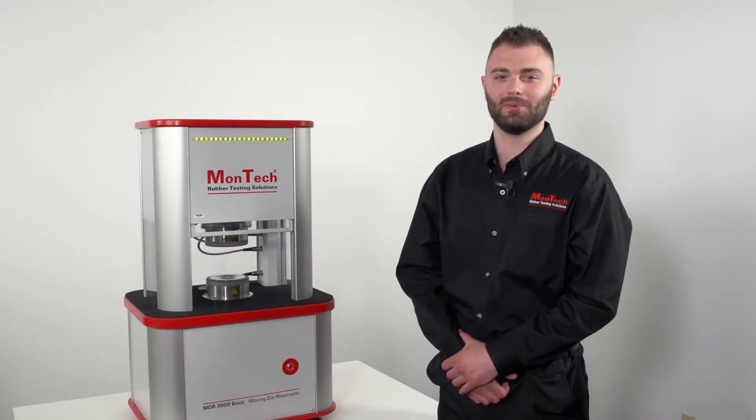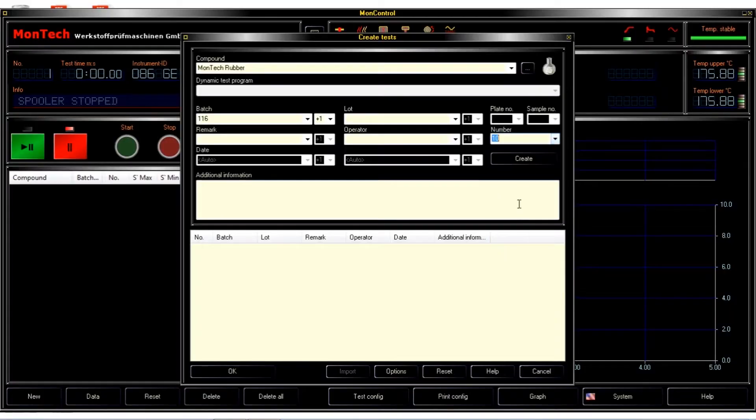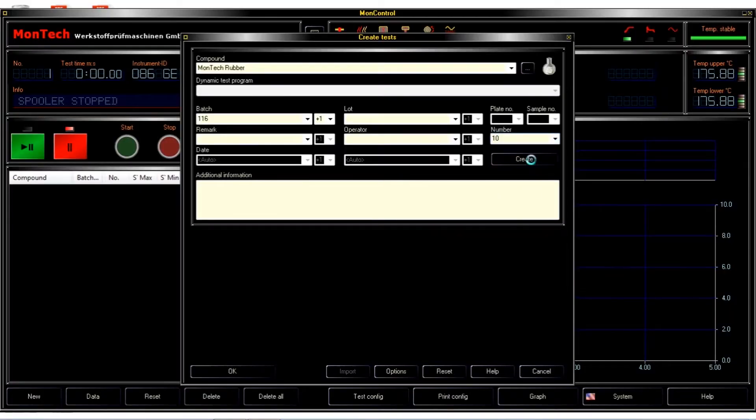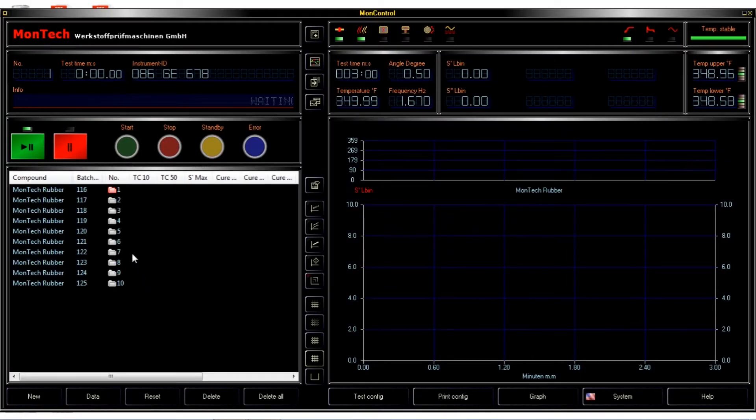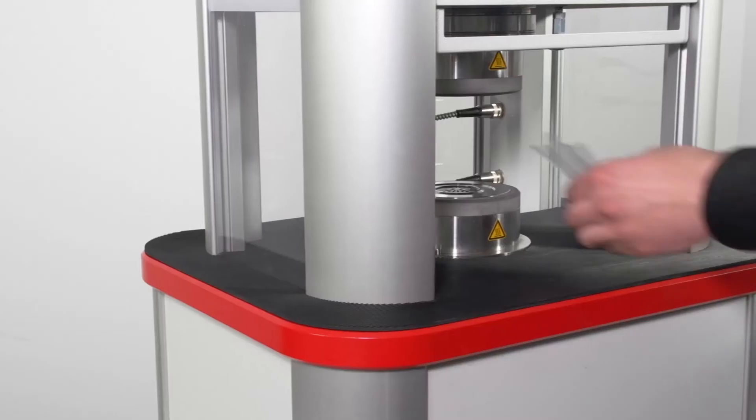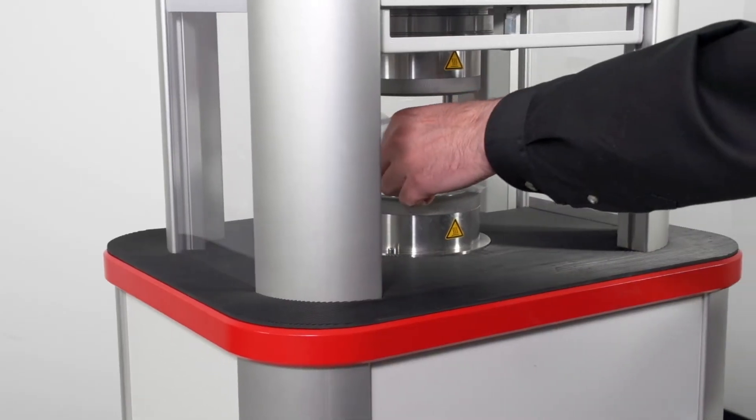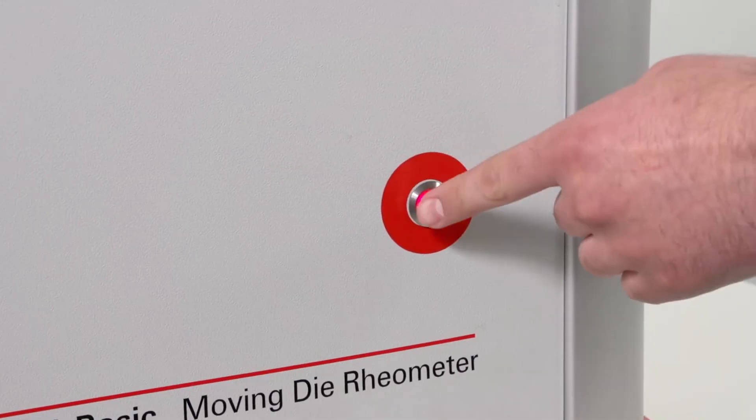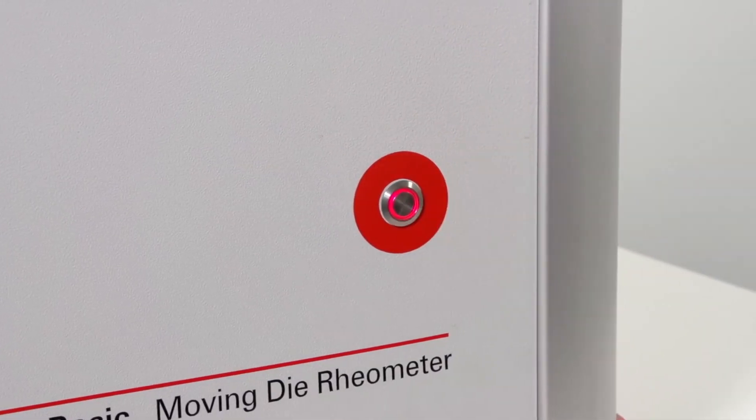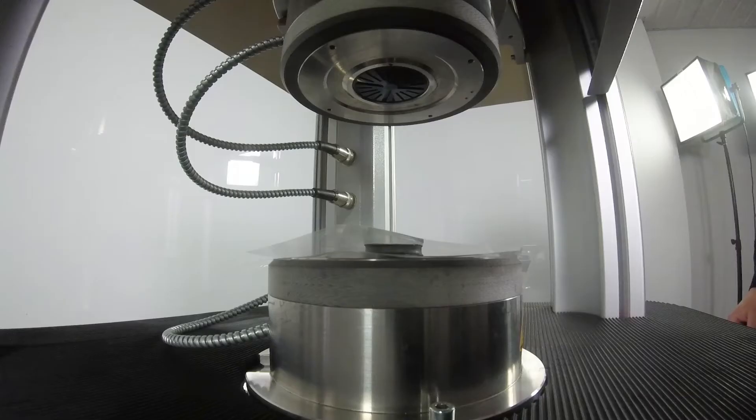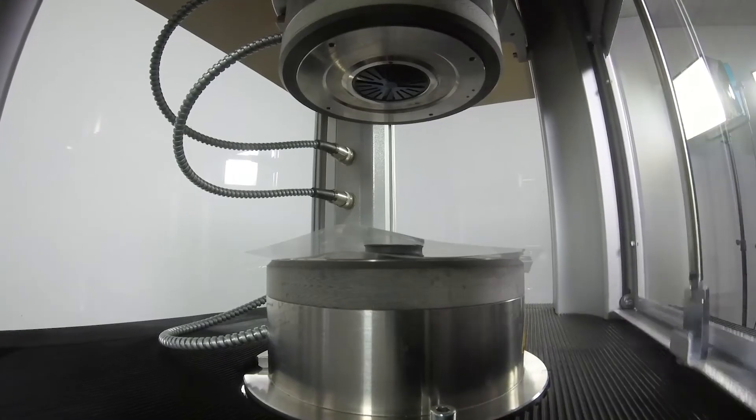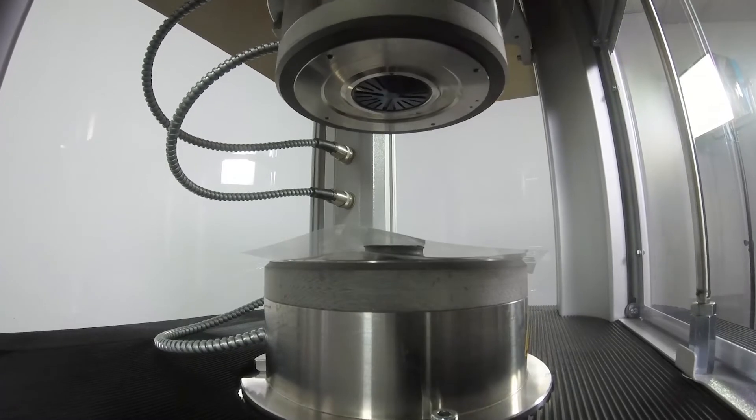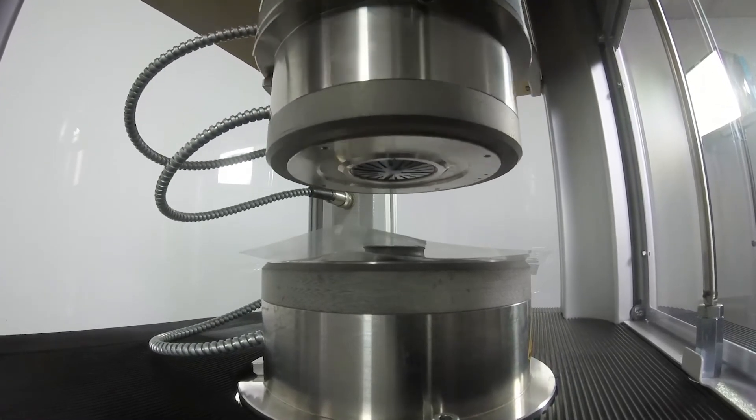Running a test is simple. Create a test sequence within MONControl software. Place the sample and testing film onto the die and press the start button. The instrument's safety shield lowers, the cylinder and platens close, and the test begins.